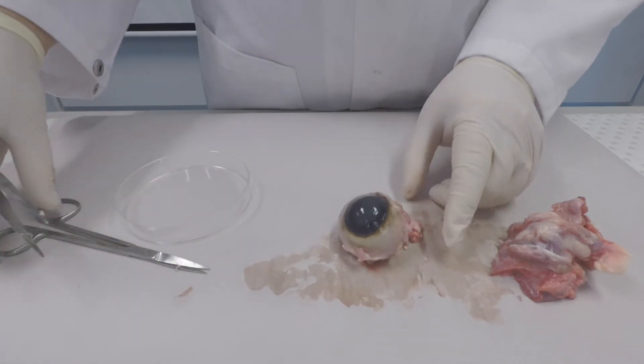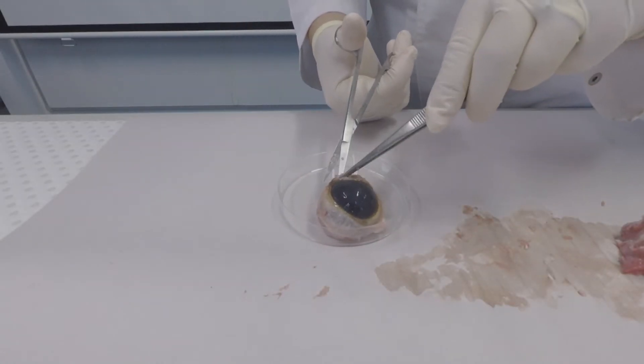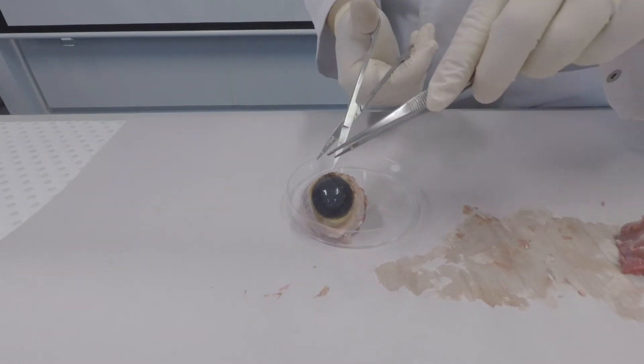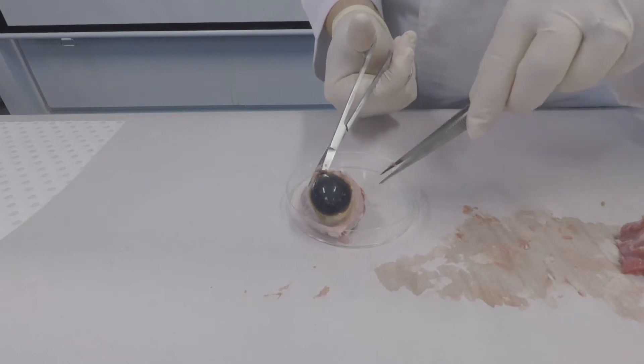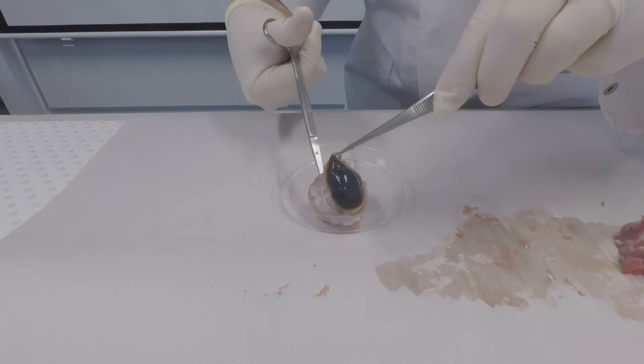This is the cornea at the front of the eye. Now we're going to dissect the eye. First of all, I'm going to cut around the cornea through the sclera, the sclera being the tough outer portion of the eyeball.